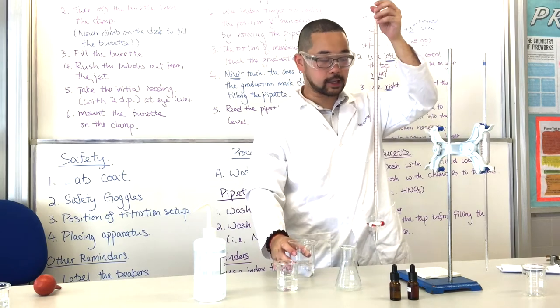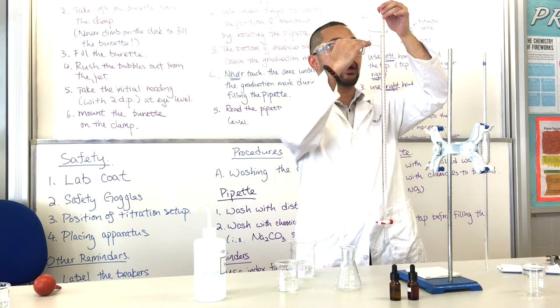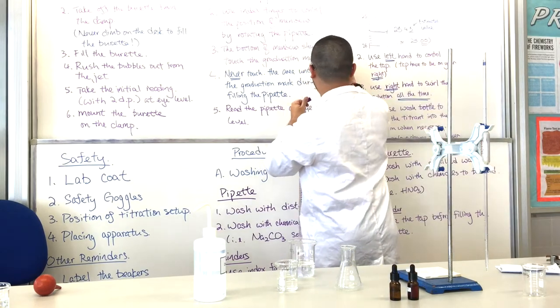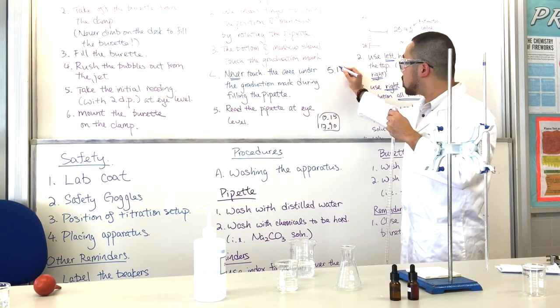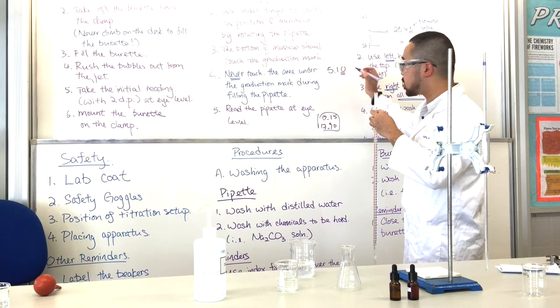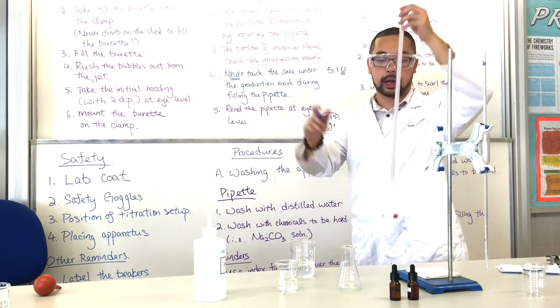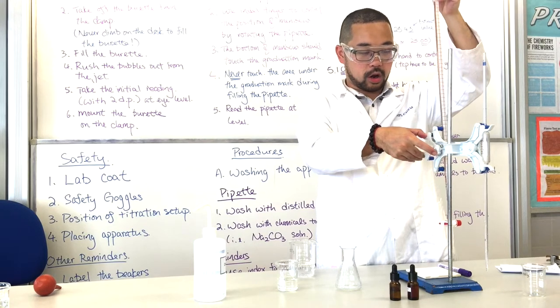After you fill the burette, you can now read the readings. Take the initial reading. Now you can see it's about 5.10. Remember, the reading has to be to 2 decimal places. The first decimal place you can read from the burette, but the second one is an estimate; you have to estimate it on your own. After you take the reading and put it down in your lab worksheet, you can mount it again onto the clamp.